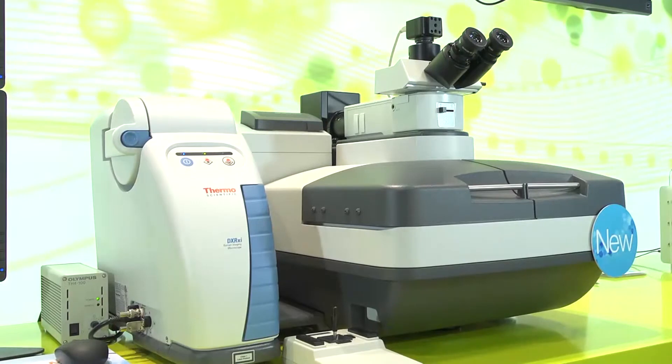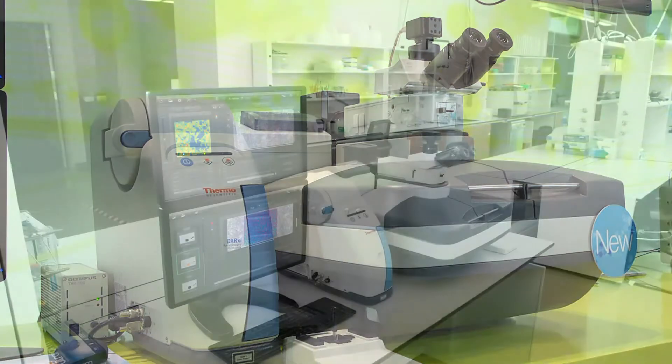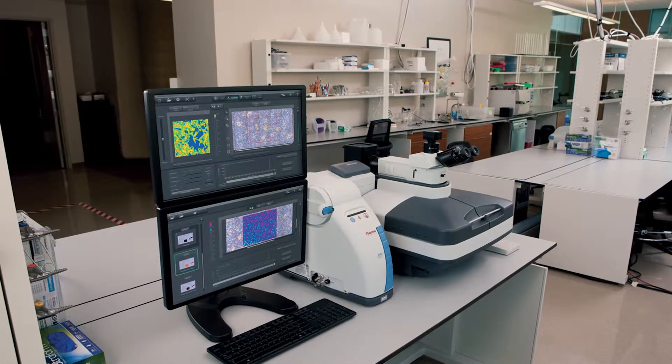The DXR-XI is also great for multi-user environments where you have first-year graduate students, through visiting scientists and post-docs, a broad range of different expertise.